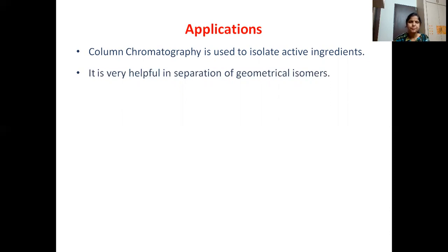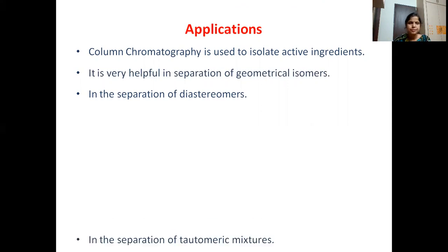In the separation of diastereomers, here also it is the same case. Among the diastereomers, one may be optically active, so that compound may have different affinity towards the stationary phase. Based on the difference in the affinity towards the stationary phase, again, the separation can be easily done.